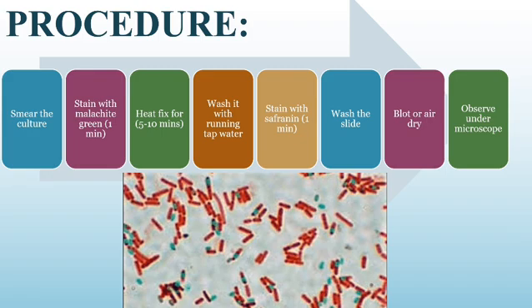Wash it with running tap water. After washing it, stain it with safranin for 1 minute. Wash the slide, blot or air dry the slide, and then observe it under the microscope with oil.